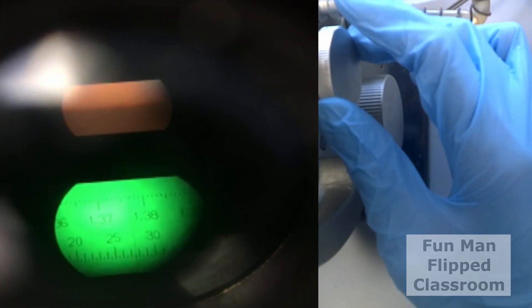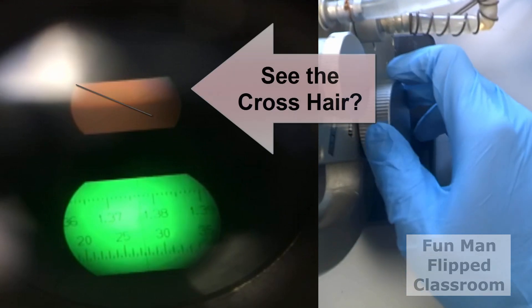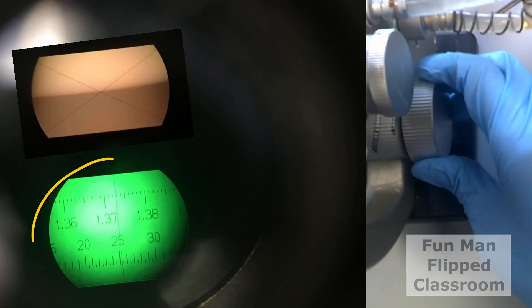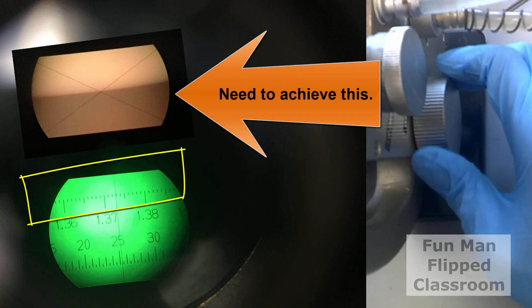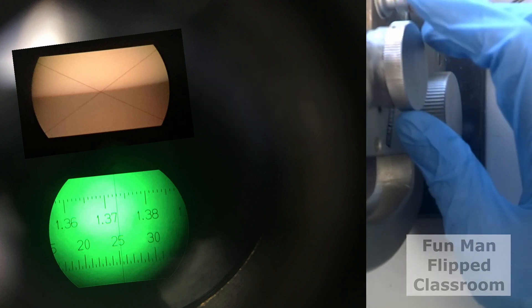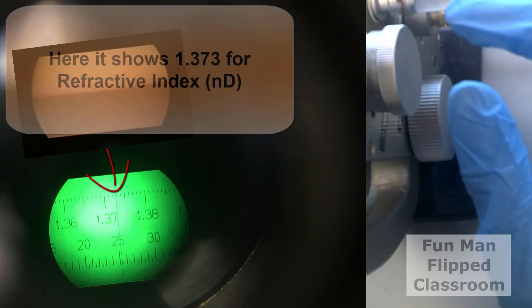At this point, turn the measurement knob to set the boundary line to the intersection of the crosshairs. For the lower scale view, this is where you can record the refractive index reading. The upper scale is for reading refractive index, while the lower scale is for the bricks percent. Read off the scale and take down the reading you need. That's it.